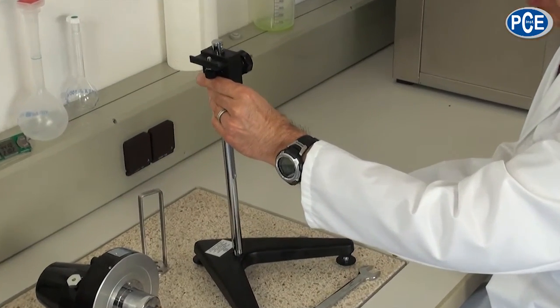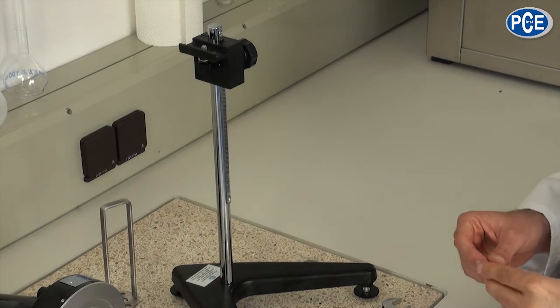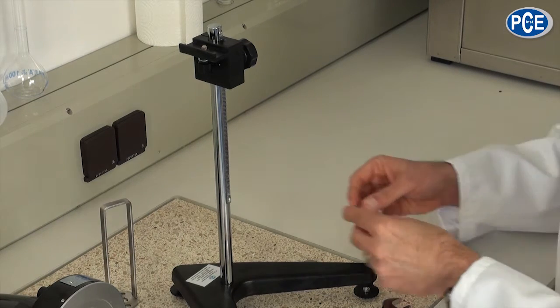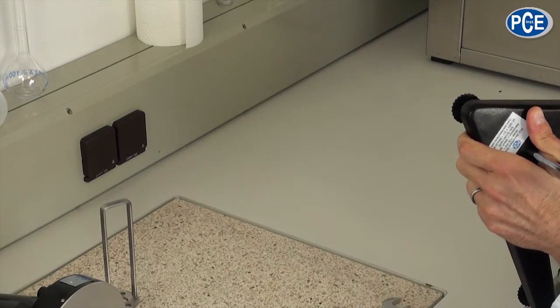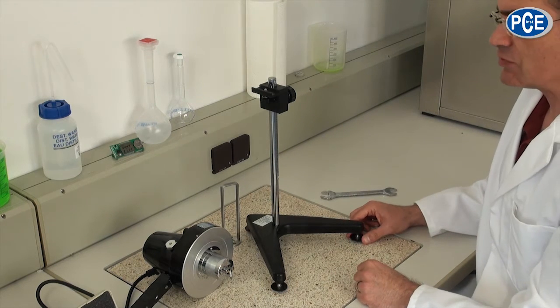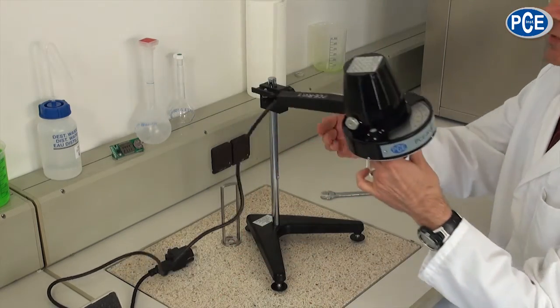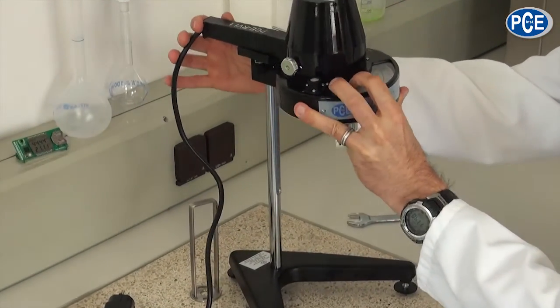I would like to show you now the construction of the viscometer. The supporting rod is put simply into the stand and with the nut and spanner fixed. The rod is fixed and we can now take the viscometer and sit it onto the mount. For this we take the viscometer in hand and fix it with the screw on the stand.